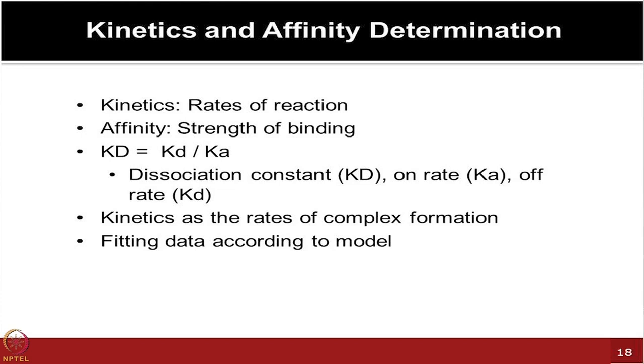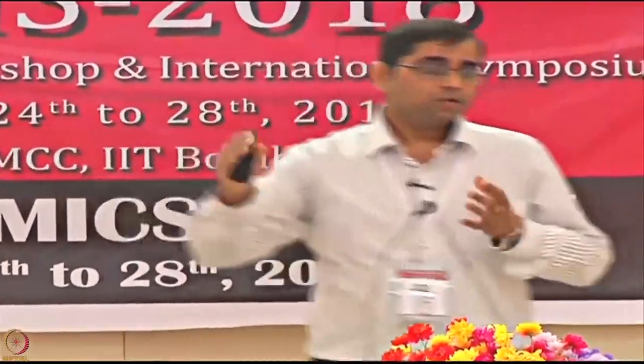As we talked, you are getting the kinetics, or the rate of reaction, which you can monitor in a label free and real time manner. You are looking at both the on rate and off rate of these reactions. Unlike label based methods where you are just saying binding is happening or not happening, here you are saying binding is happening, but probably the on rate was very fast or the off rate was very slow. So those kinds of information you can obtain.